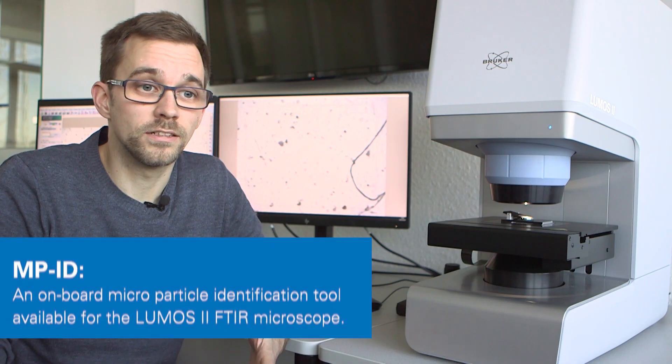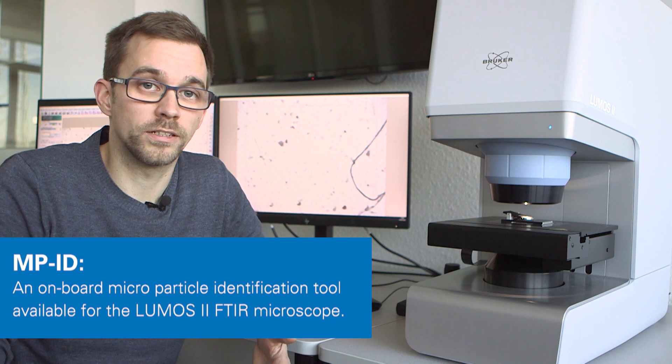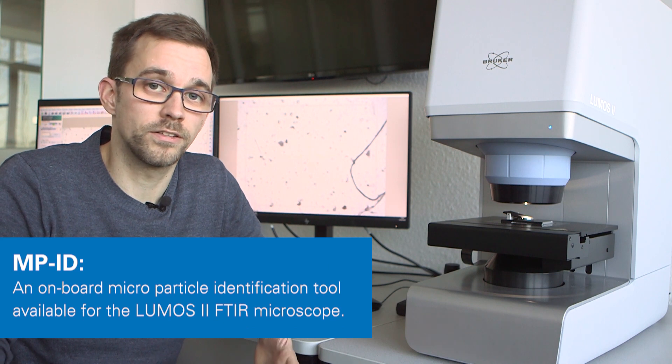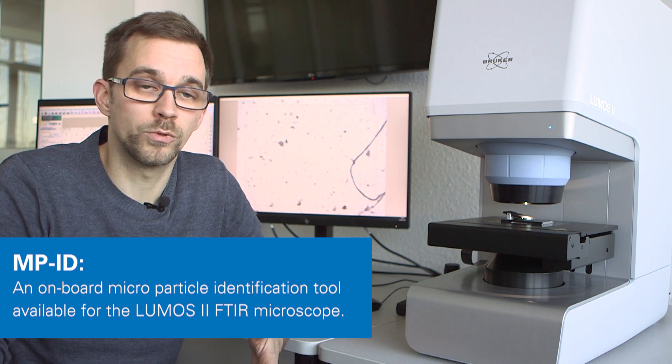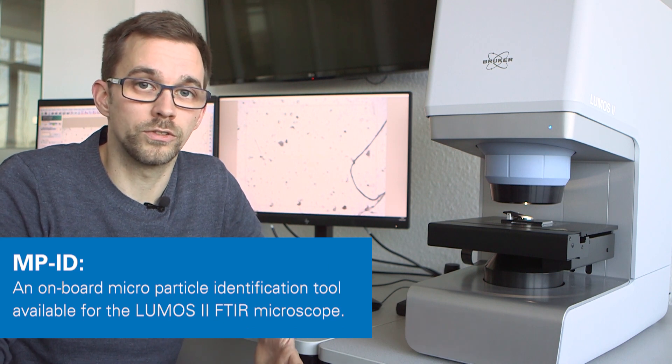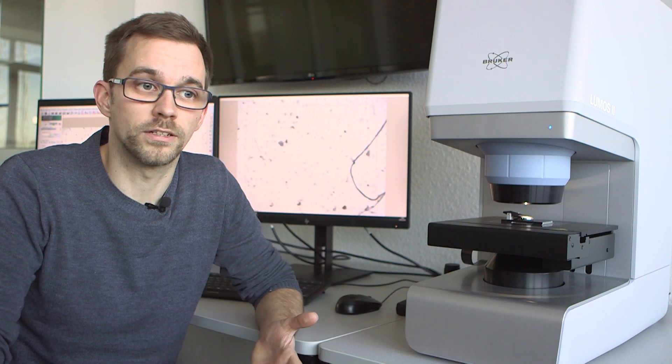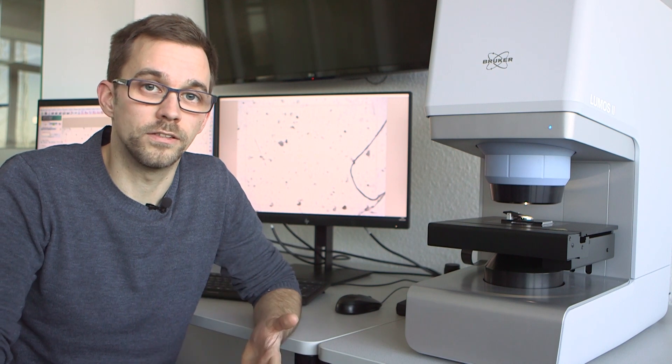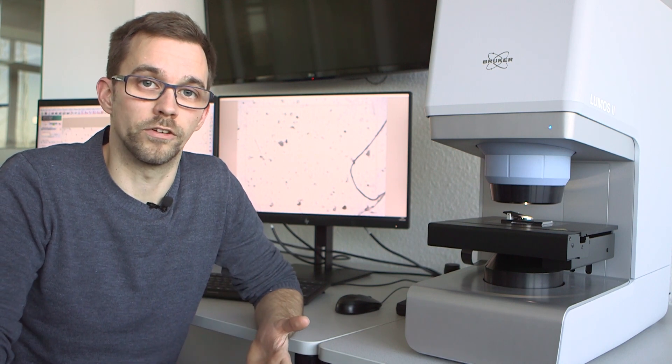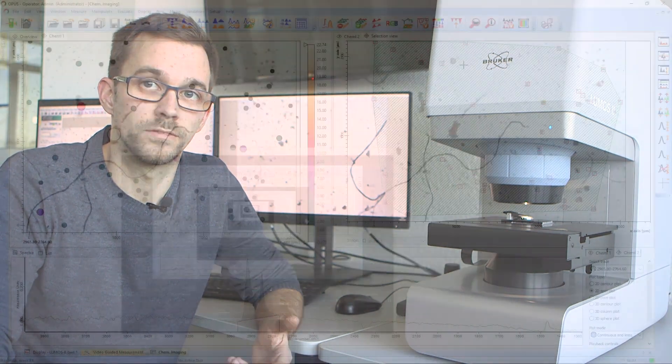MPID stands for microparticle identification and is Bruker's on-board solution for the chemical analysis, size evaluation, and statistical distribution of microparticles.